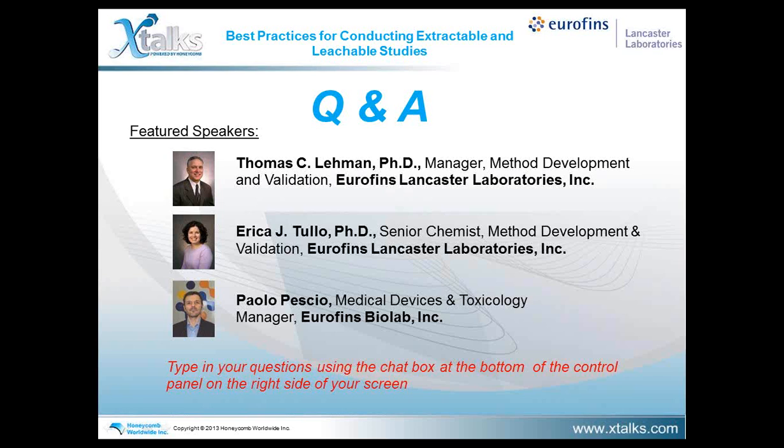Okay, thank you for that. Another question here. One second. When would leachables not be a subset of extractables? Would this imply that the extractable conditions used were incorrect? Your thoughts on that?